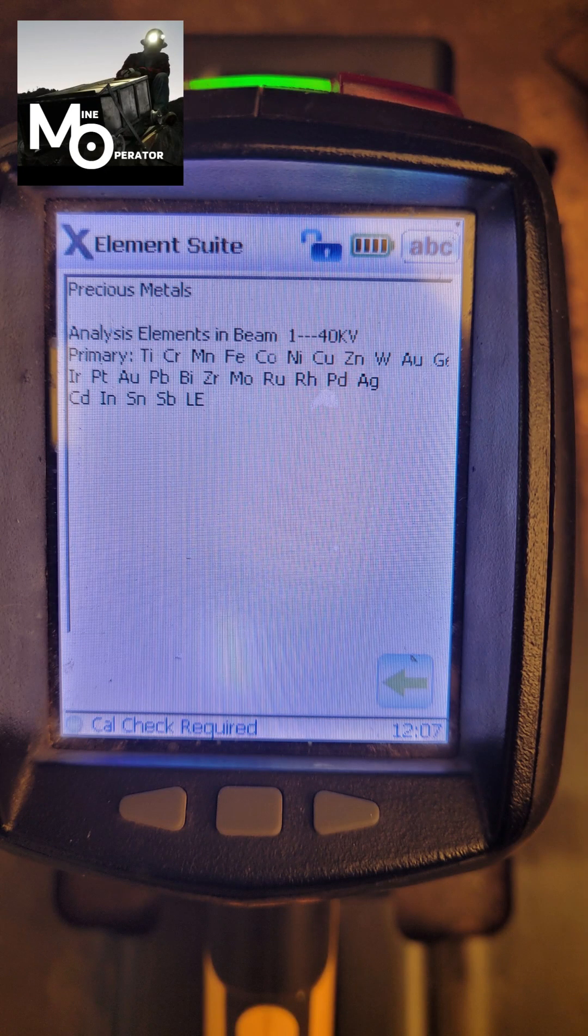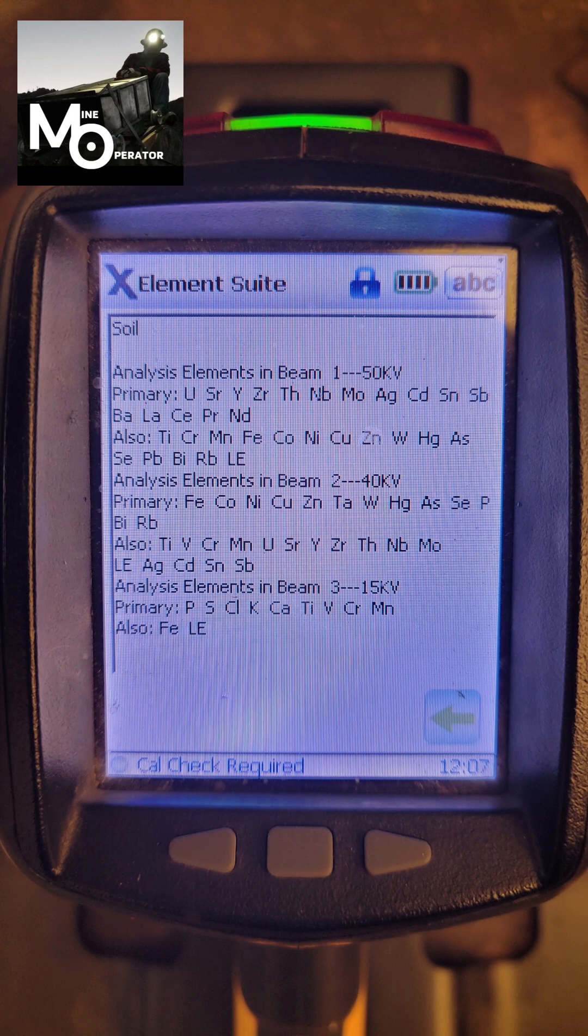These are the elements that we can identify in precious metals mode. And these are the elements we can identify in soils mode.